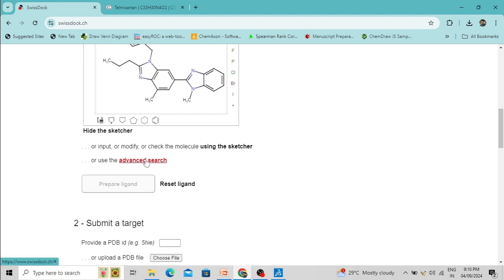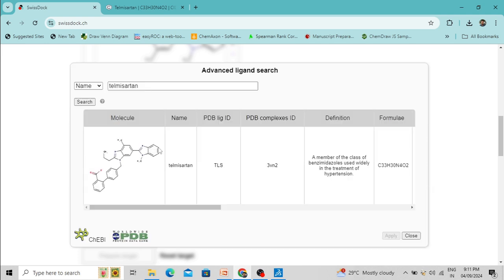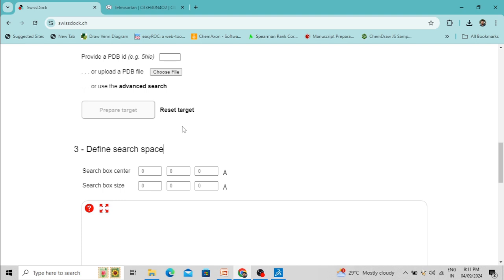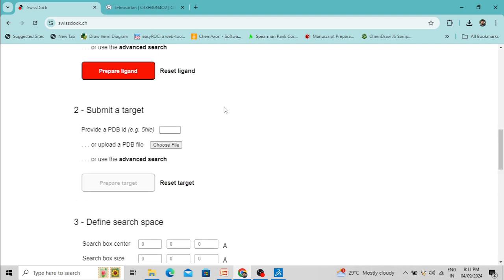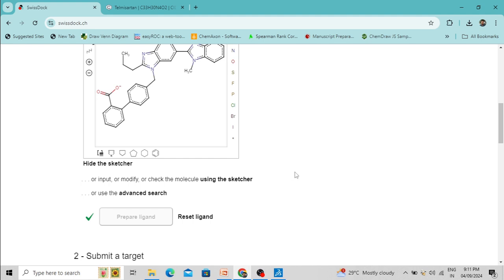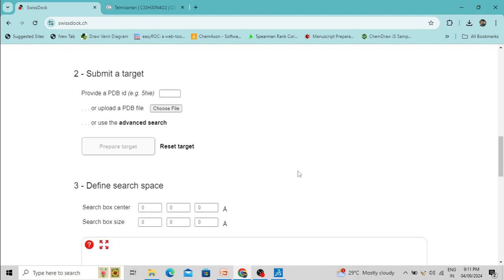An advanced search option is also available. For example, I am typing the name Telmisartan, then clicking the 'Search' button. I have selected the molecule and clicked 'Apply'. A checkmark has appeared, confirming that the ligand has been uploaded successfully.